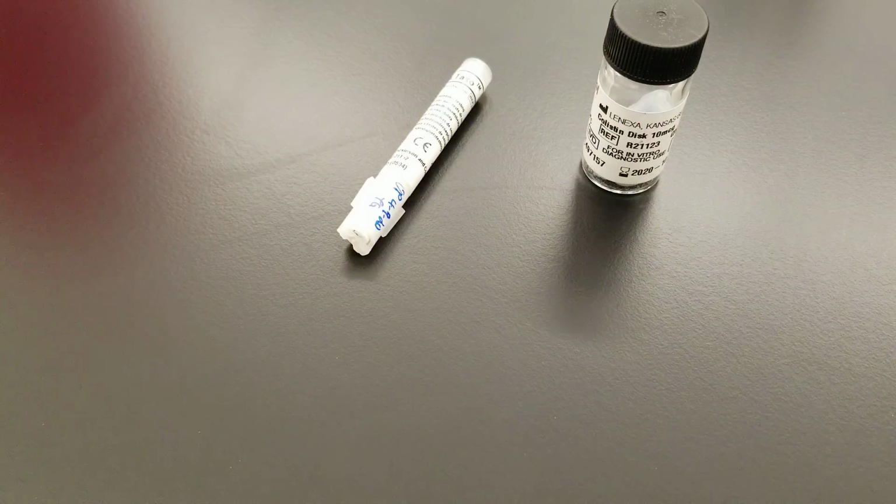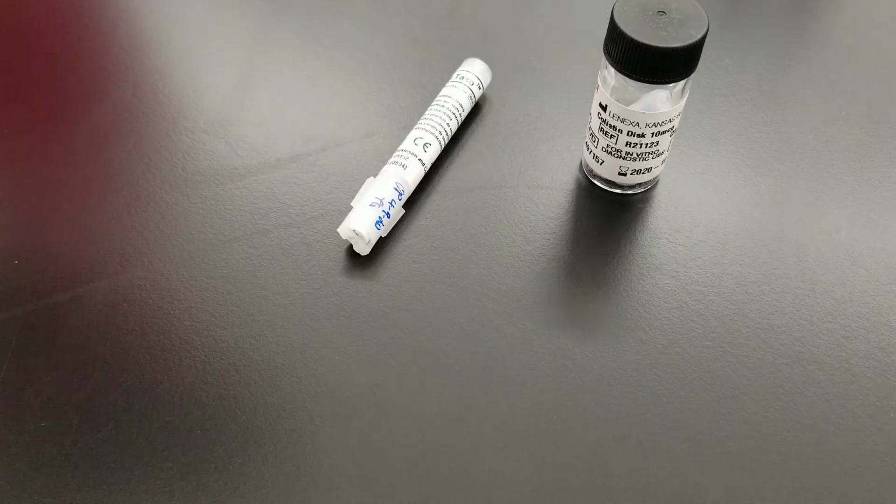The names that I have on these plates are fake people, but I still don't want to put them on video just in case. So we have unknowns for the class that we're doing right now, and so we're going to do an aerotolerance test for at least one of the specimens on video right now.